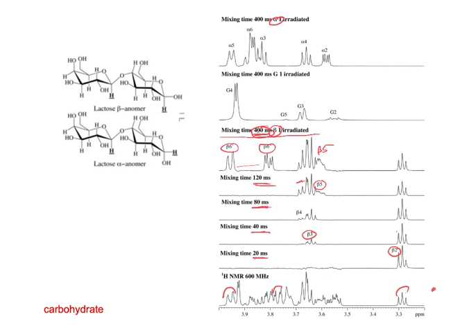And again, they see alpha 2, alpha 3, alpha 4, alpha 5, and the alpha 6 protons. So we're essentially extracting the signals from one spin system out of this mixture of essentially 3 compounds, or 3 spin systems.